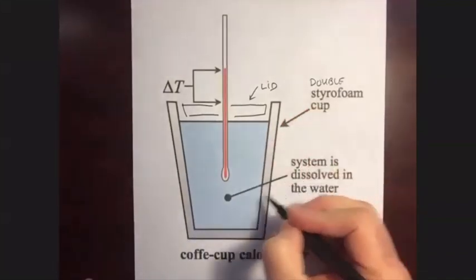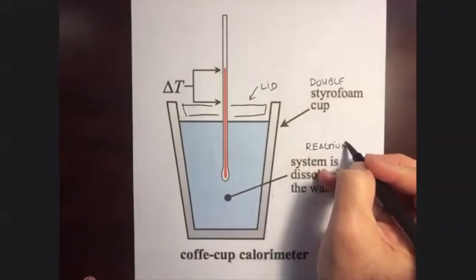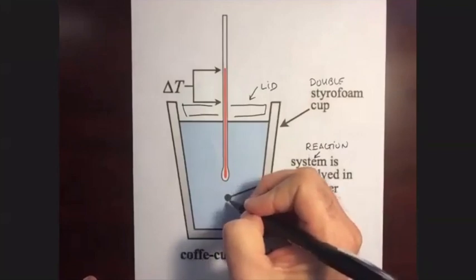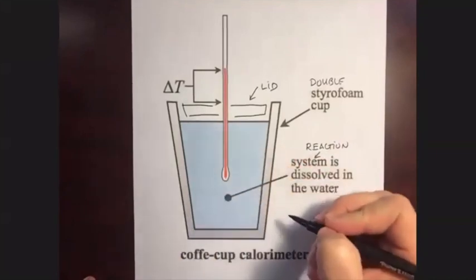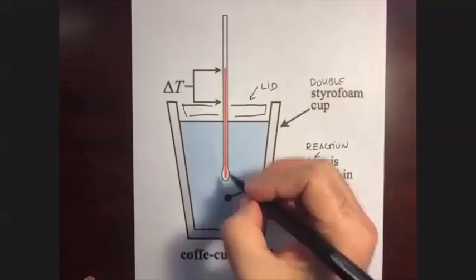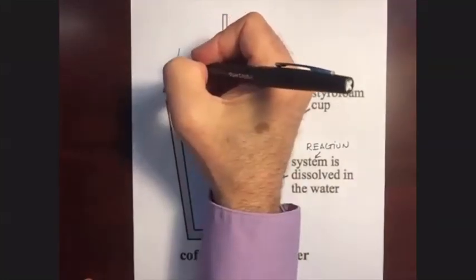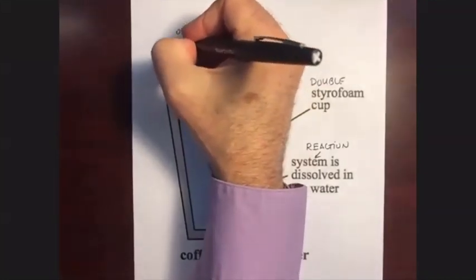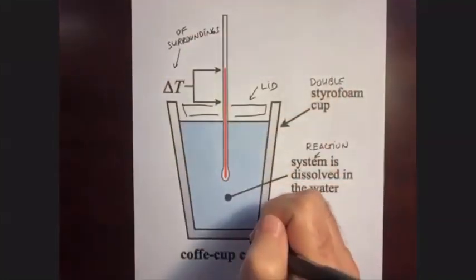So if our system is essentially a reaction that is happening in an aqueous solution, that means that the surroundings to our system are the solution and, of course, the inside wall of the calorimeter. Now, we're not going to measure what happens in the reaction. We're going to put a thermometer here in the solution, and we're going to measure the temperature change of the surroundings. That's what we're going to be measuring. Temperature change of the surroundings, all right?